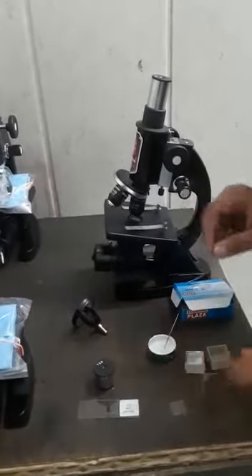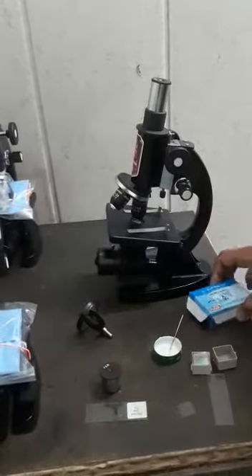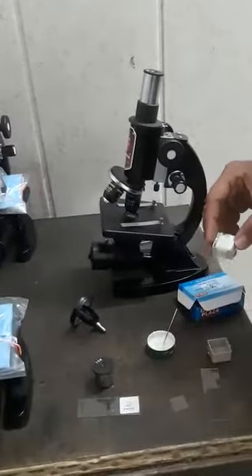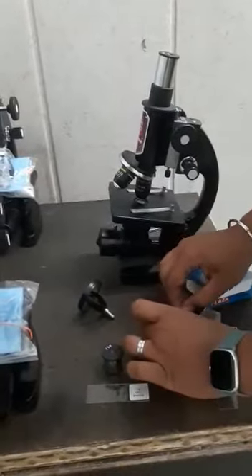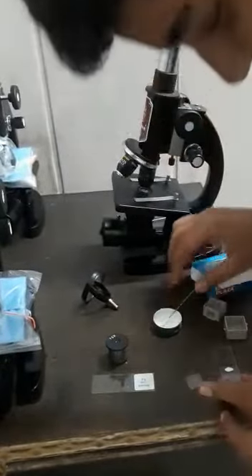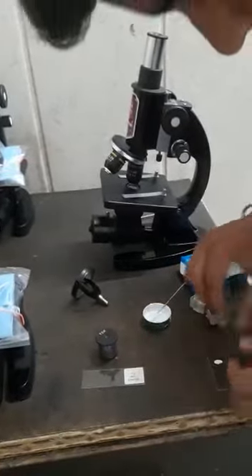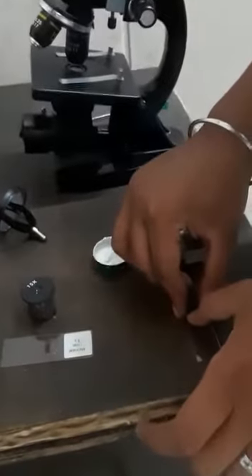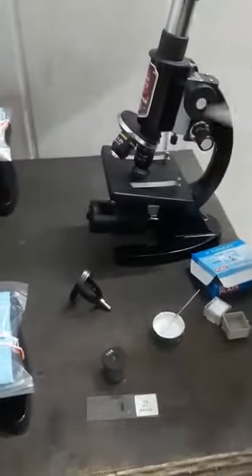Now I will tell you how to create a sample. This is a plain slide box, and this is the box of glass cover slips, which are used in forming a sample. I placed a specimen on an empty plain slide, then put a glass cover slip on top — my sample is created. I will now place it in the microscope to see the results.